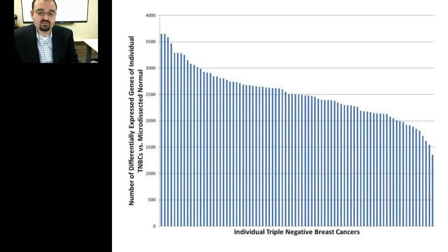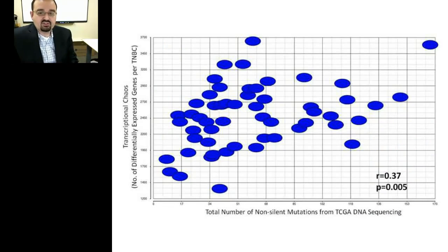This work is now actually being further taken with a combination of inhibitors that target PI3K and also porcupine, now being tested in vivo in patient-derived mouse xenografts. Another aspect that we took advantage of RNA sequencing was to actually study the heterogeneity of this disease. As I mentioned in the introduction, DNA mutational-based heterogeneity is being actively studied in a variety of cancers, and we wanted to see if we can apply the same heterogeneity concept to RNA sequencing in triple-negative breast cancer.